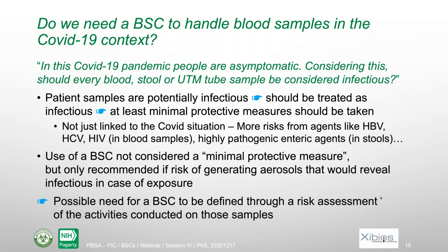So in this case, I would not say that each time we have samples, because they could be contaminated with any of those agents, we need a biosafety cabinet. It depends on the activity. So you need to assess the activity. And of course, if there is a risk of creating an aerosol and that aerosol could be infectious, in that case, you should consider a biosafety cabinet.